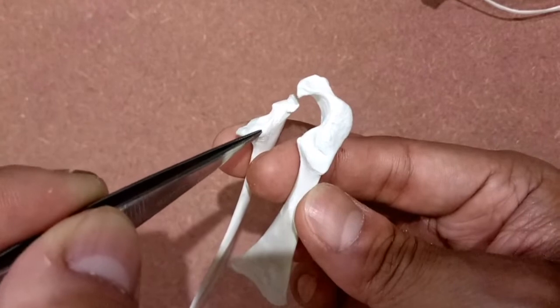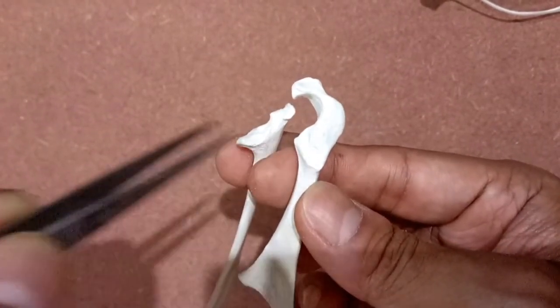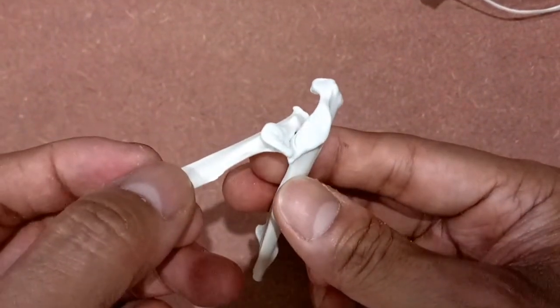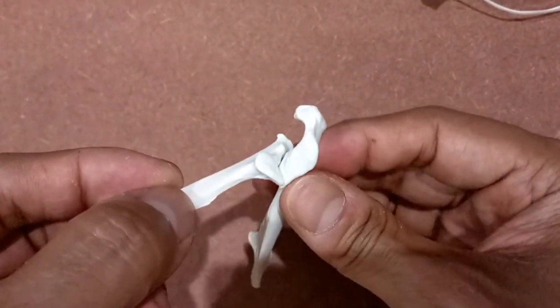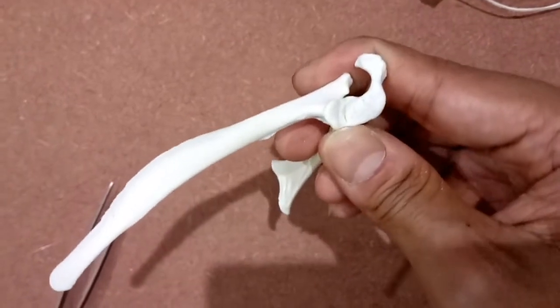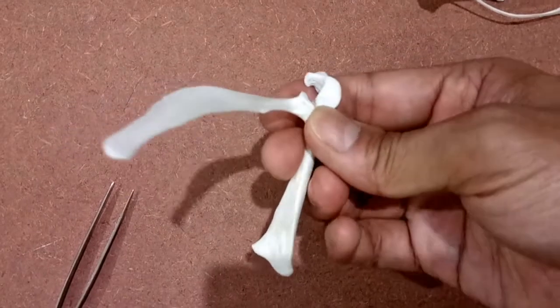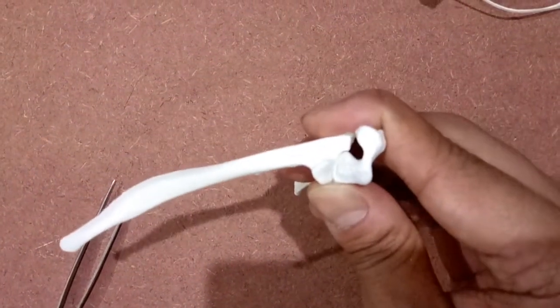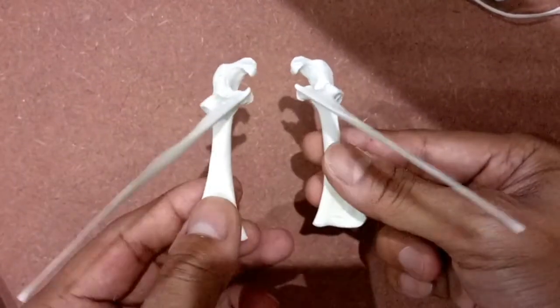This area on the scapula will fit onto this area in the coracoid — it's as simple as that. Do the same with the left coracoid and scapula.